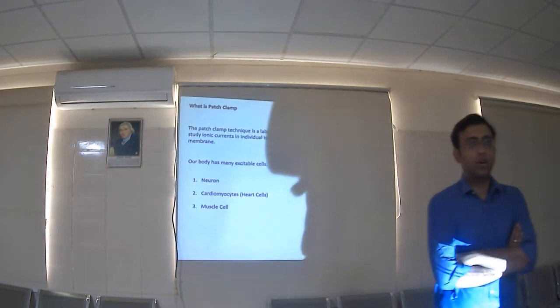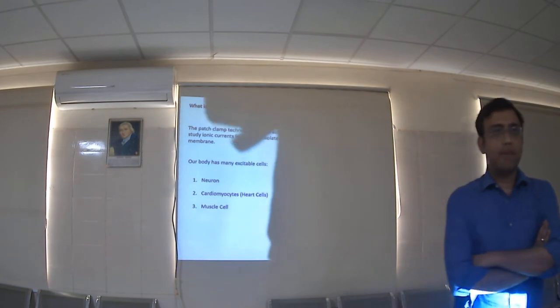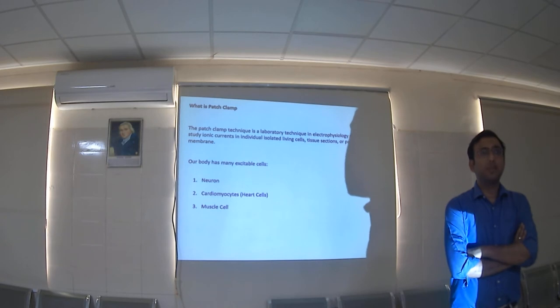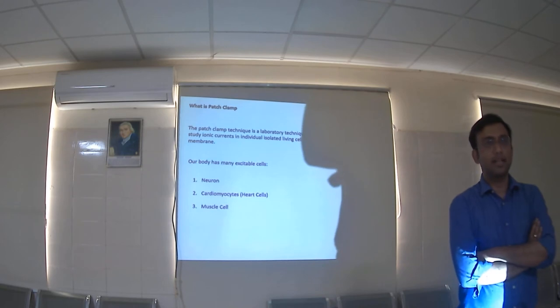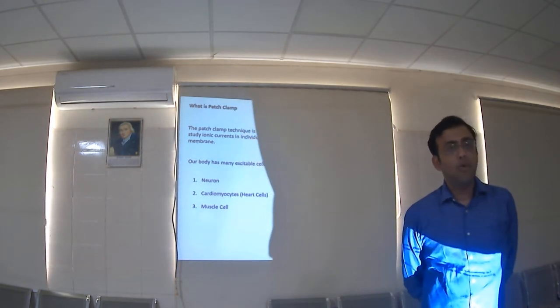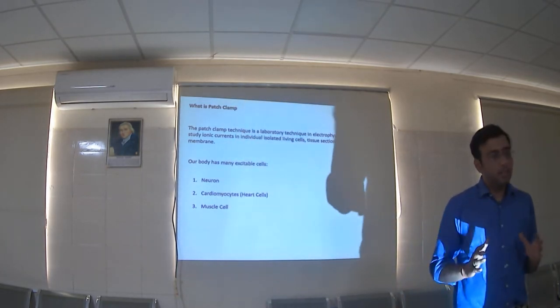So today we will deal with patch clamp technology. You all are aware of ion channels? What are the different types of ion channels? Actually, there are different types of ion channels which are present in all the excitable cells in our body, like neurons, cardiac cells, muscle cells, or other types of cells. So patch clamp is one of the techniques which is used to measure the current using these.